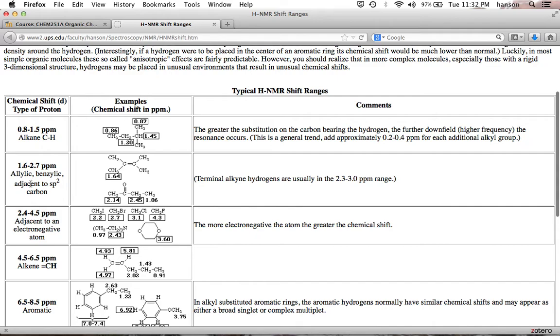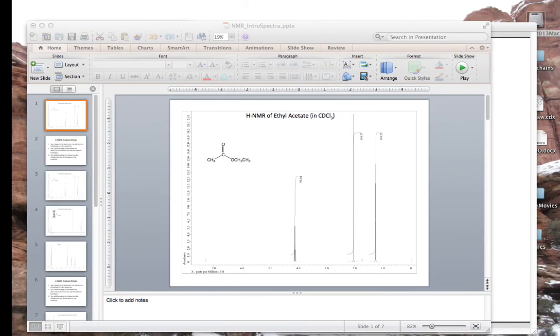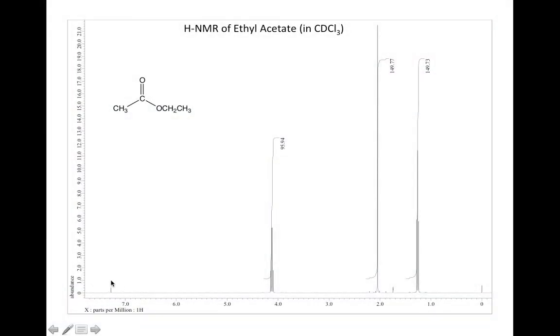Now, the one last thing I want to mention about chemical shifts is, although I've given you these simple little regions to learn, chemical shift effects are additive. So if you had something next to 2 electronegative atoms, it might come up further than 4.5. For example, dichloromethane, which has a carbon with 2 chlorines on it, those hydrogens come up at like 5.2 ppm. And as we saw before, in chloroform, right up here around 7.26, that's a hydrogen on a carbon with 3 chlorines next to it.